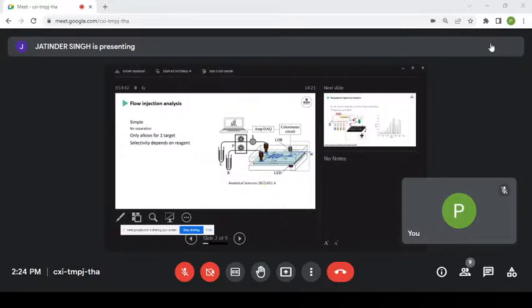What did we do with the serpentine? Who remembers from yesterday? Why did we have those swirly, whirly S channels? Mixer. Yeah, so we want to give our reagents the opportunity to mix.